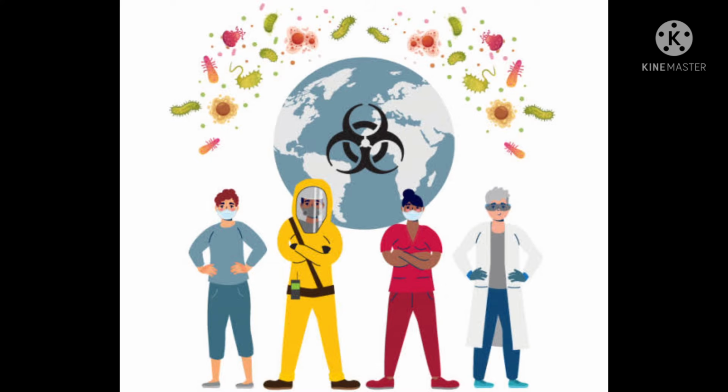To sum it all up, biosafety focuses on laboratory procedures and practices necessary to prevent exposure to and acquisition of infections, while the maintenance of secure procedures and practices in handling biological materials and sensitive information falls under biosecurity.